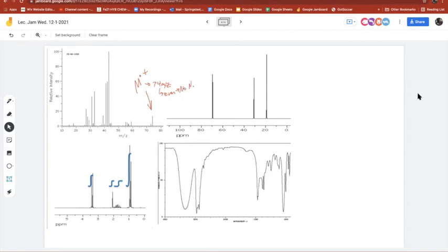It's not a doublet, and it's not 79 plus, or doublet. So that means no bromine. But I do see right here, I have an alcohol, huh? So it has an oxygen, which equals CH4, remember? So let's do it. Rule of 13 on 74.